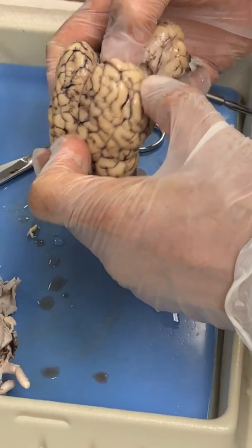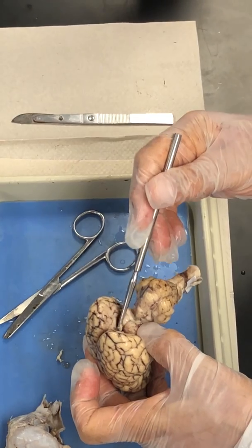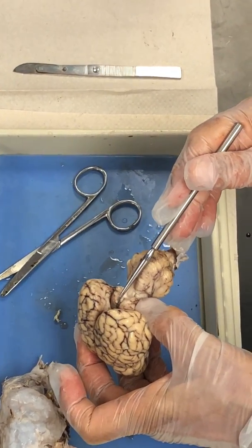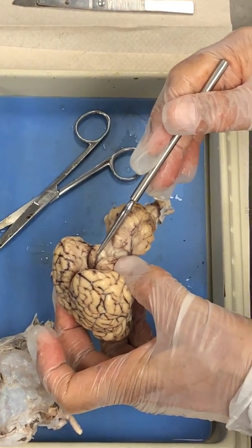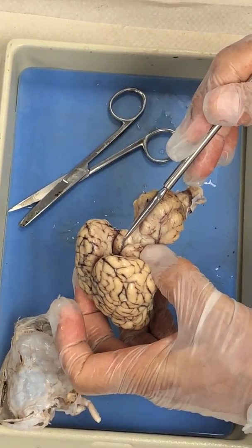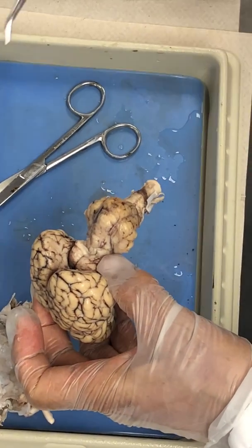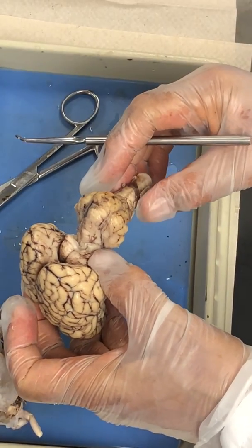Then you have to be really careful, extremely careful, and bend it a little more. And right on top of the corpora quadrigemina, you're going to see the pineal gland or the pineal body. You'll have to get close to see it. It's not going to look anything like what you see on the model. You're going to see the whole three-dimensional part of the pineal body.